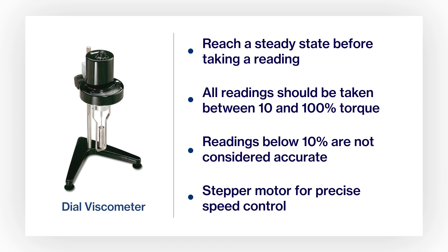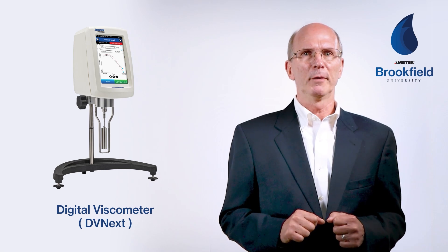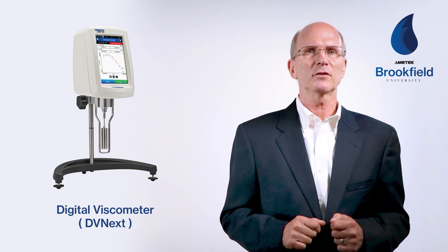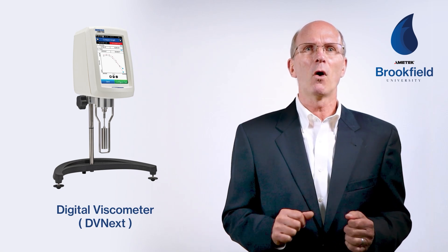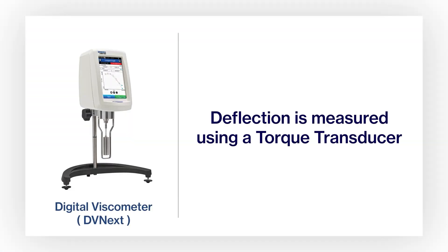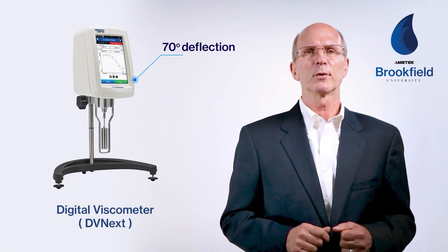A stepper motor is used to provide precise speed control and can be set to rotate at specific speeds to perform rheological studies of your material. In this image, we see a digital viscometer. The operator no longer has to read a pointer on a dial or use a factor to calculate viscosity. The operating principles are the same for all our instruments, but in this case, the spring deflection is measured using a torque transducer which electronically converts to viscosity and displays results on the screen. Rather than the 320-degree deflection of the dial viscometer spring, the digital spring deflects only 70 degrees from 0 to 100 percent torque.